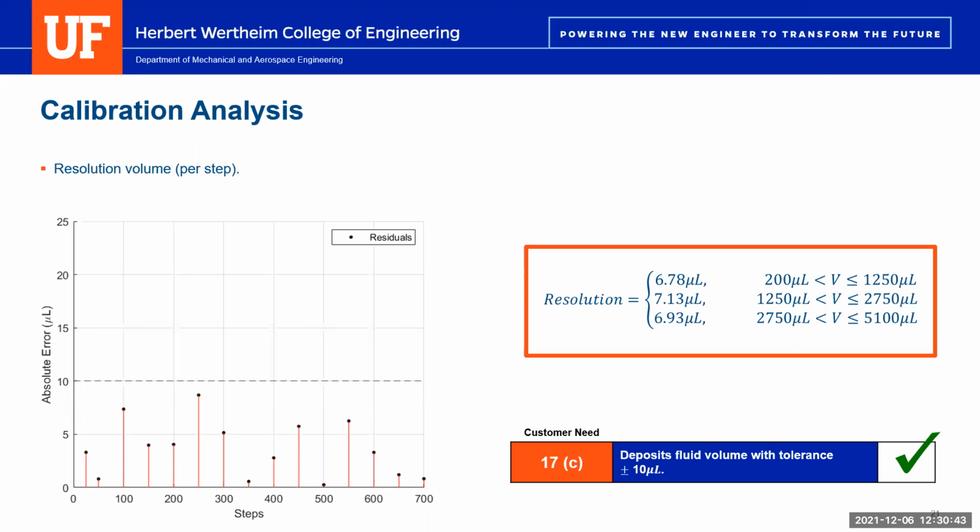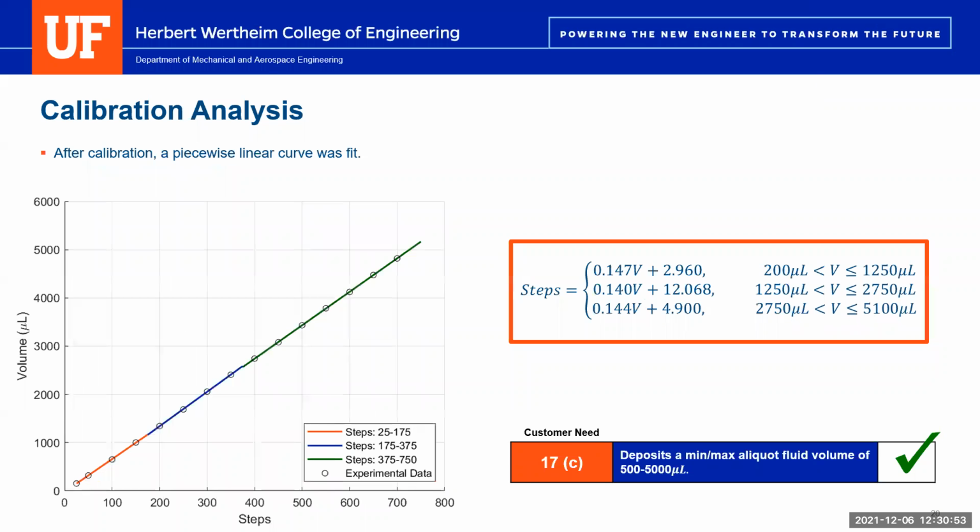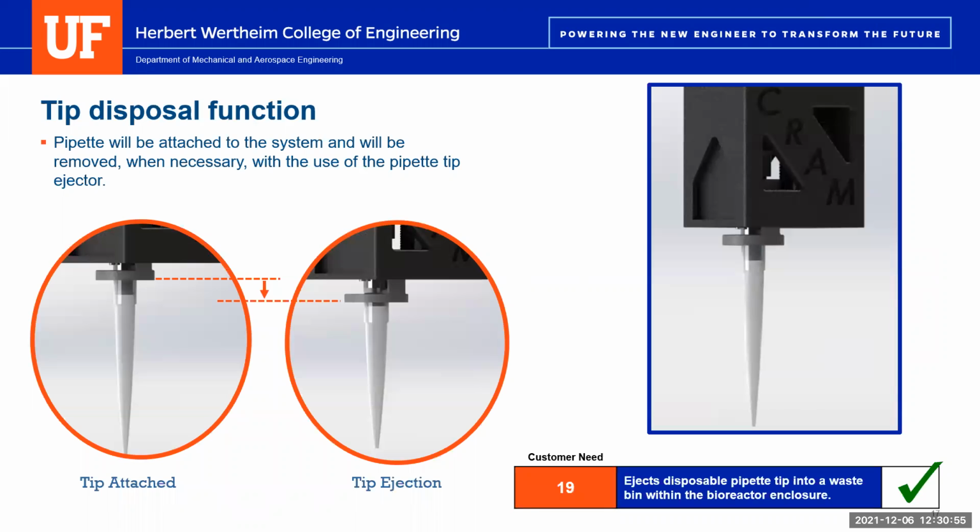When you were talking about ejecting the tip, the tip is being ejected, but then you said it would have to be manually put in. Is a lab researcher going to have to reach into the machine and attach a new pipette, or did I miss something there?